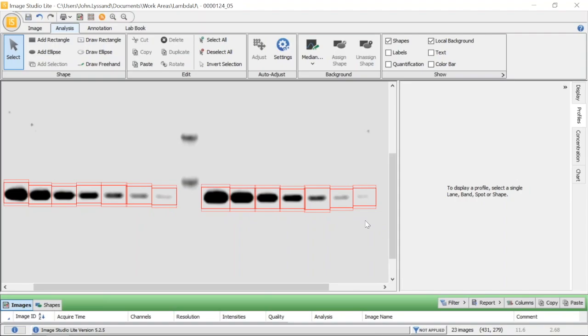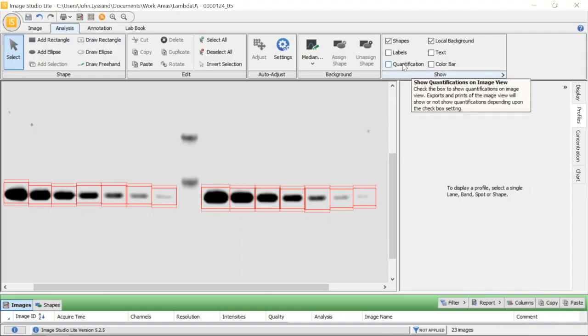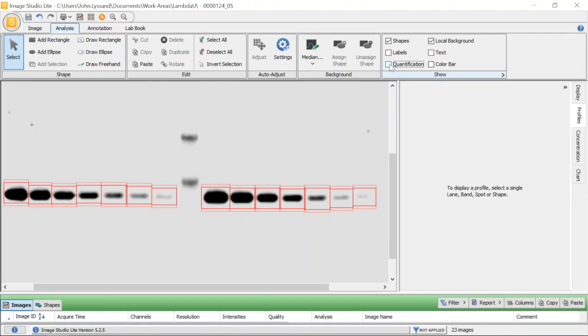Now, at this point, where's our data? If the data is not already shown, make sure to go to the analysis ribbon to the show section. Here you'll see a quantification checkbox. Go ahead and make sure that's checked.